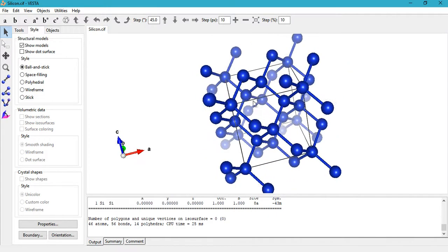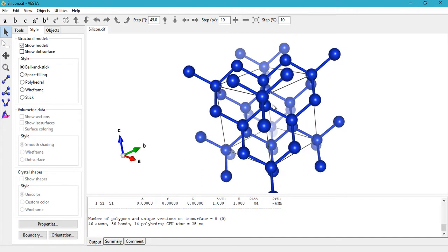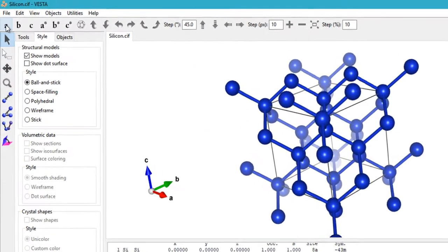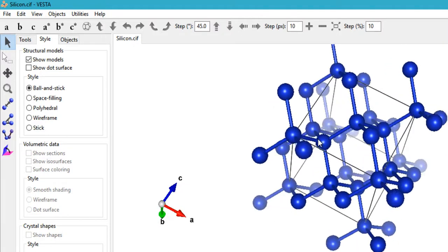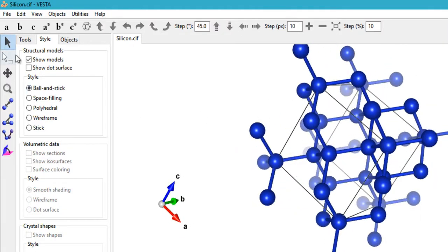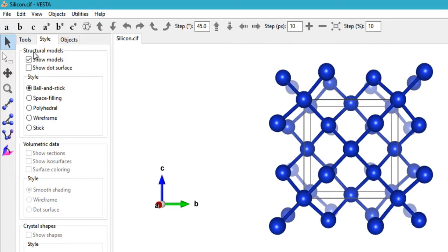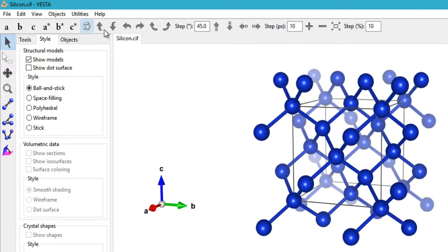If you've moved the crystal a lot and the orientation is off, you can click here to view it along the A axis, then click B to view along B, click C to view along C. You also have A*, B*, C* and a standard orientation button, which gives a 3D perspective view of the crystal.